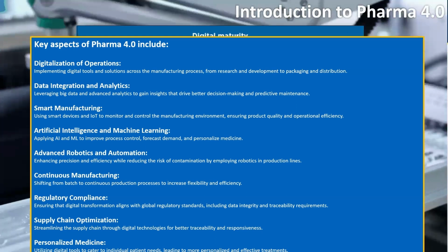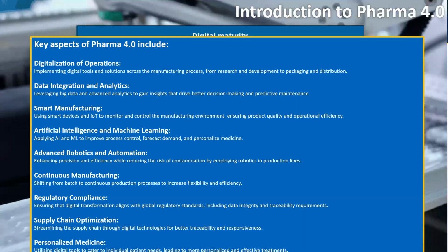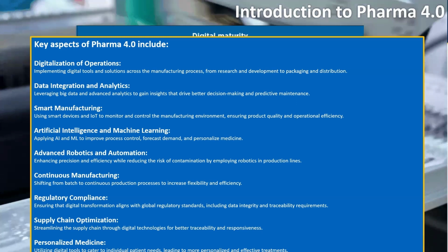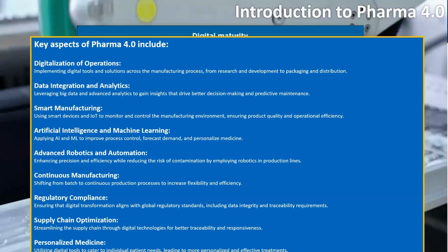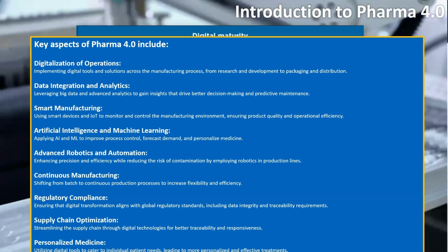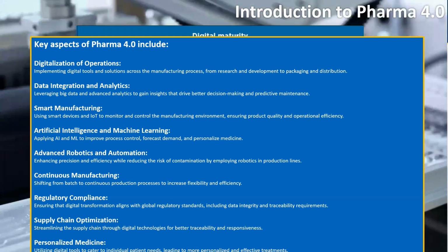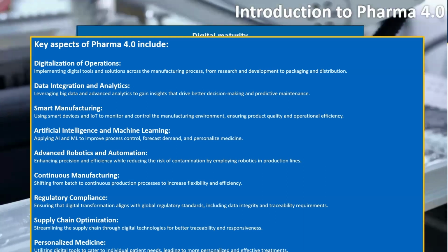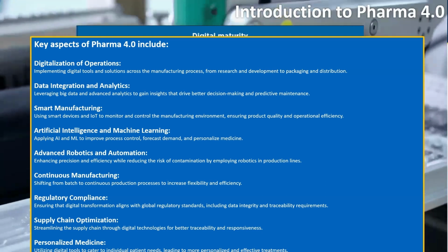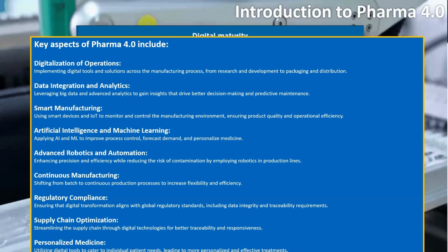Let me give you an example of implementing this digital technology. We have a traditional particle counting air sampling system like we saw on the filling machine a couple of slides back. What if we were to integrate digital cameras with facial recognition and body recognition in terms of the clean room activities? Let's say you get a particle spike on your particle counter. We could have these cameras zoom into that location and see exactly in real time what the activity may be causing that spike in particles.